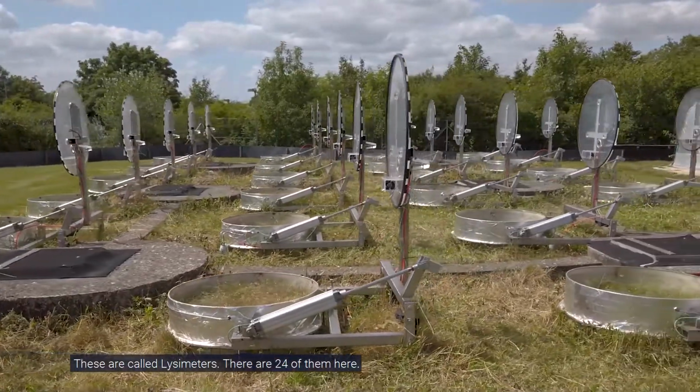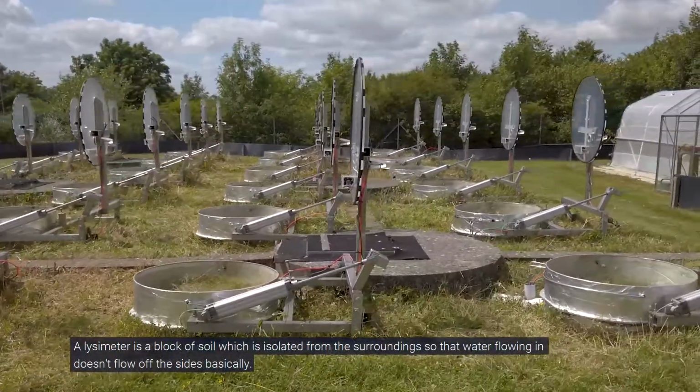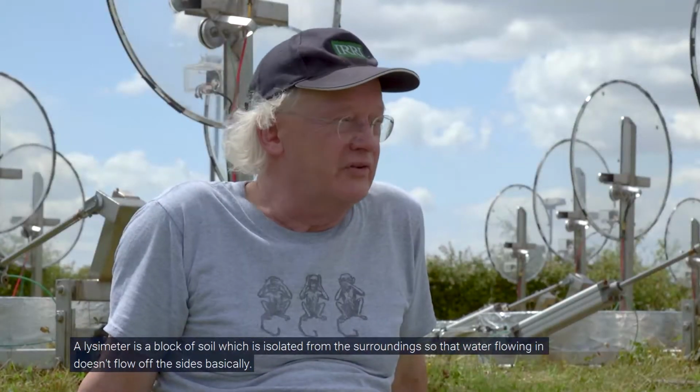These are called lysimeters. There are 24 of them here. A lysimeter is a block of soil which is isolated from the surroundings so that water flowing in doesn't flow out of the sides, basically. So we can measure what comes in at the top and what leaves at the top and what leaves at the bottom.